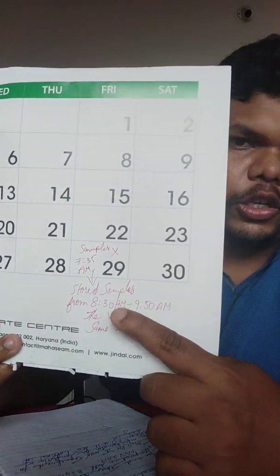So this is my calendar. Always keep a calendar note of everything that you do, it makes it easier for you. So now we're going to observe the sample.